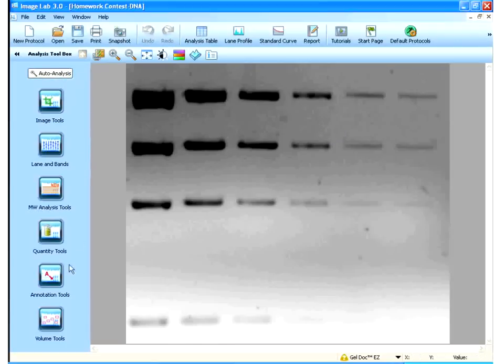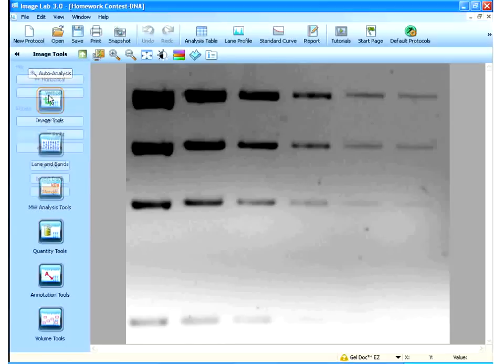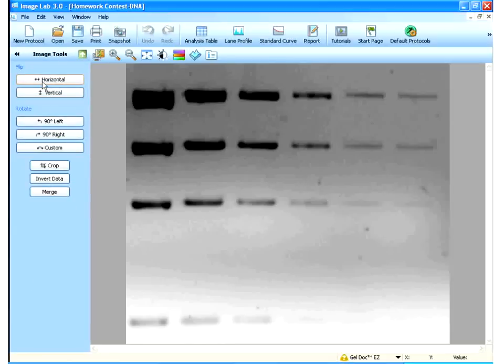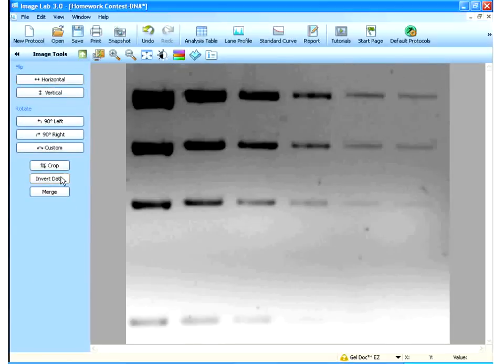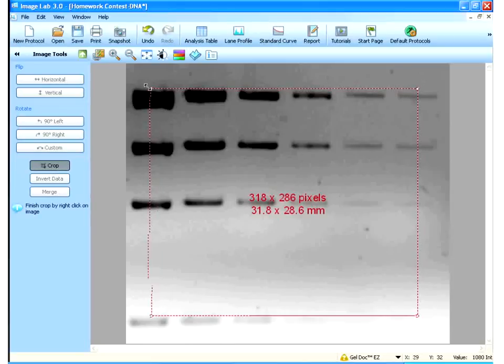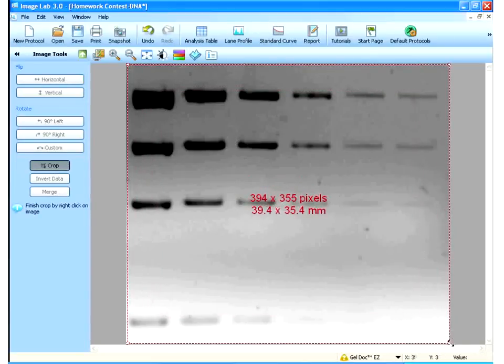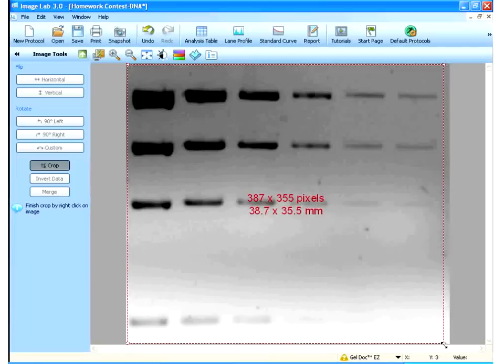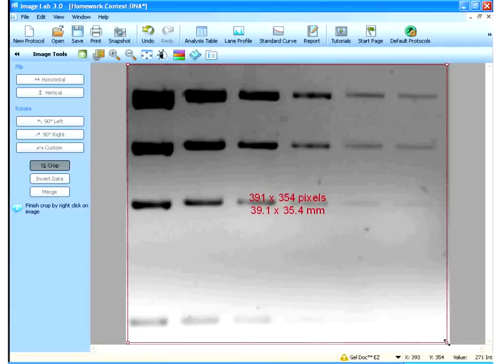What I can do is I can work my way down these steps, starting from Image Tools, to be able to analyze an image. So, I click on Image Tools. Here, I can flip the image. I can rotate. I can crop. So, I can take the crop toolbar, move it across the image, to crop out any data that I'm not interested in analyzing.